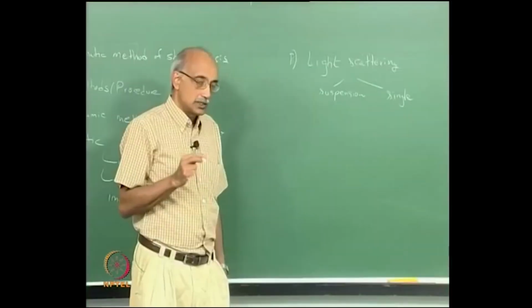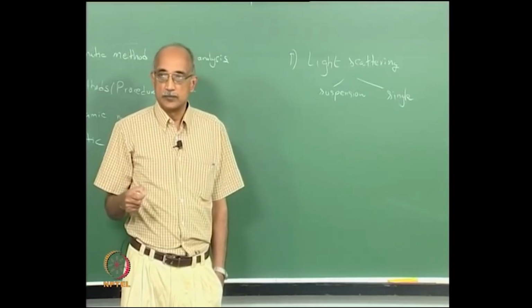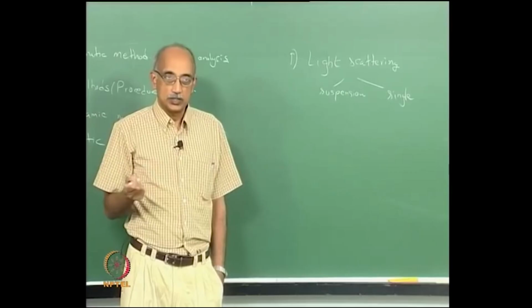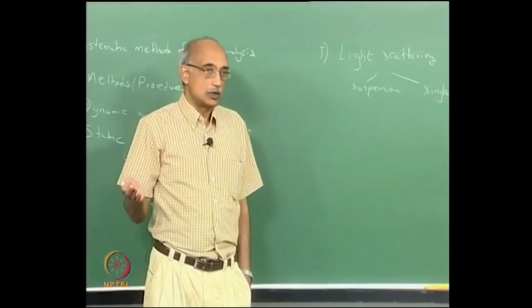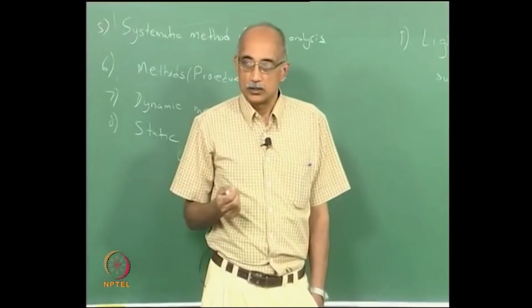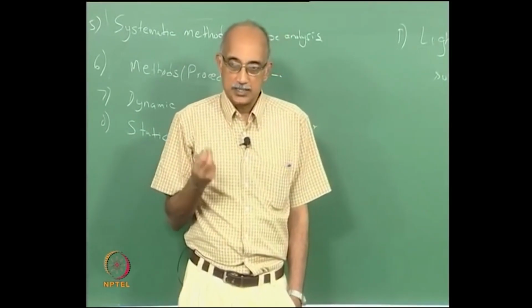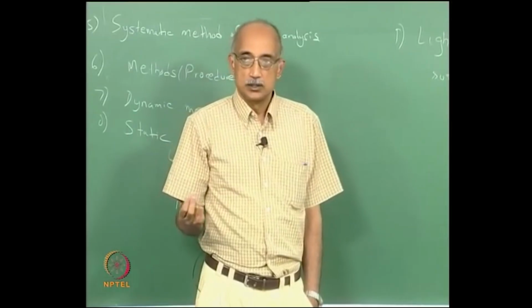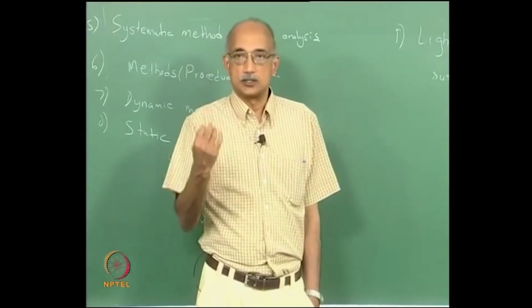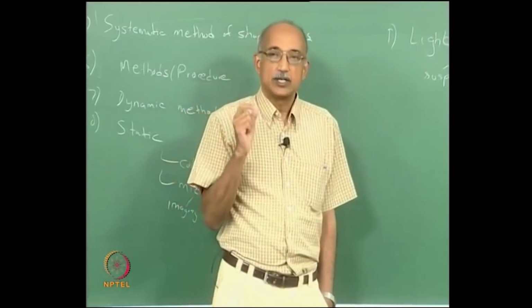Now, it is not necessary that you remember the actual equations that describe scattering intensity in these various regions. That kind of information you can always look up on the internet if you want. But what you should be able to recollect offhand is the size dependence, the wavelength dependence, or the dependence on the distance between the observer and the particle. What are the actual parametric dependencies?